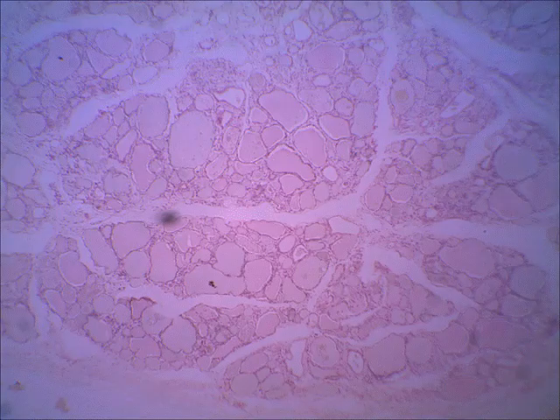Okay, now as we move to another view, another slide, now we're looking at the thyroid on a low magnification. Actually, this is with scanning, I believe. And this is showing a micrograph of the thyroid gland. What you notice the most about the thyroid, or what I notice the most, are these open areas. Now, there's something inside, so it's not like adipose cells.